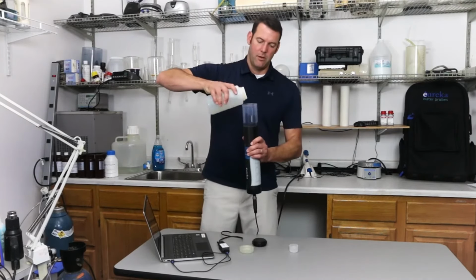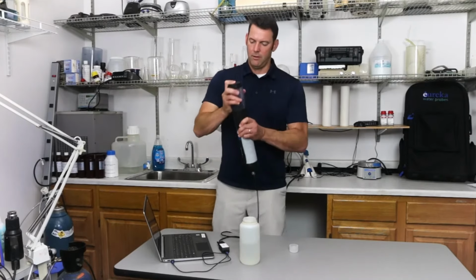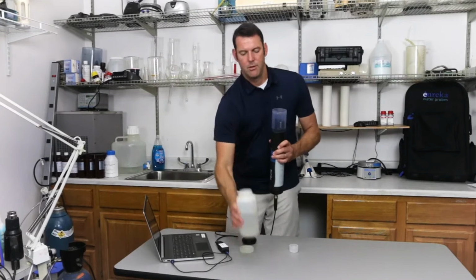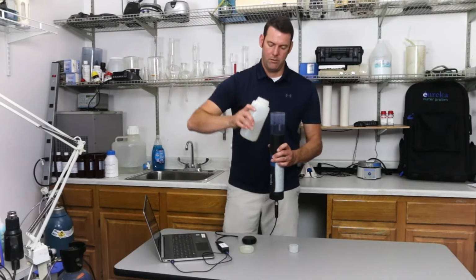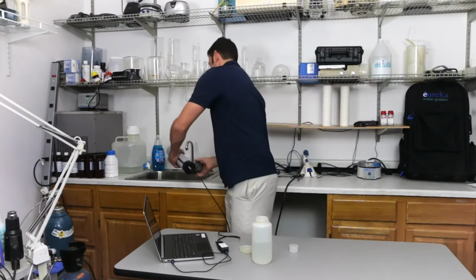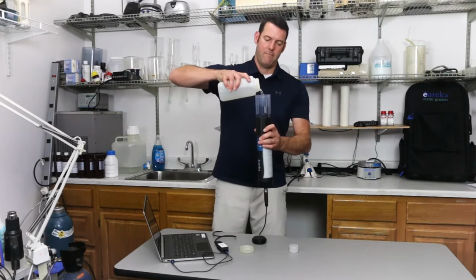So, first rinse, little shake, pour that out. Second rinse. Now fill it up.